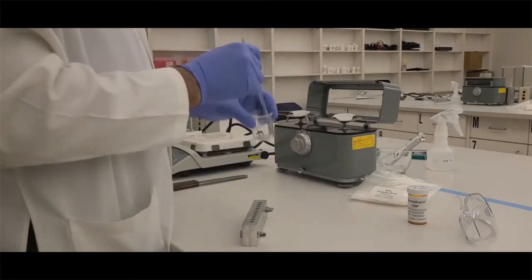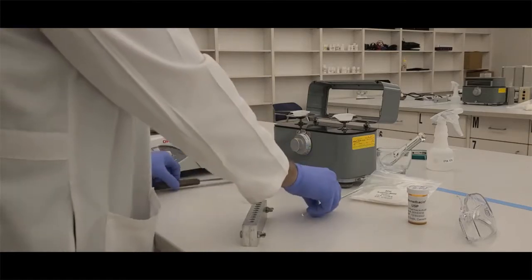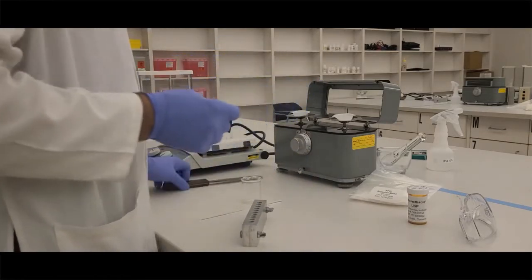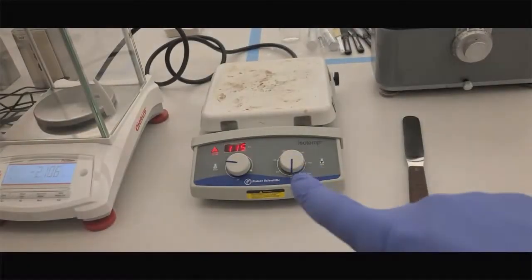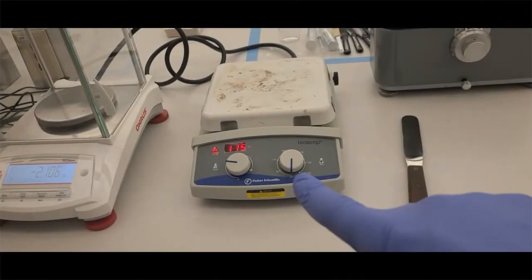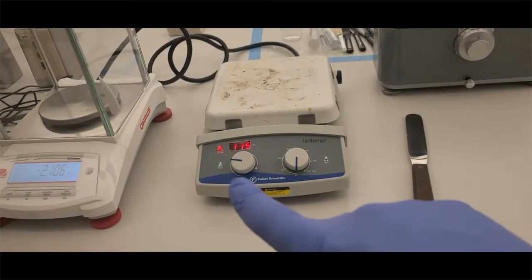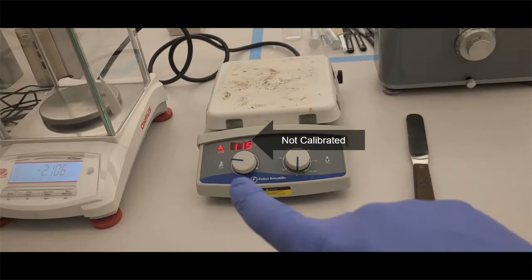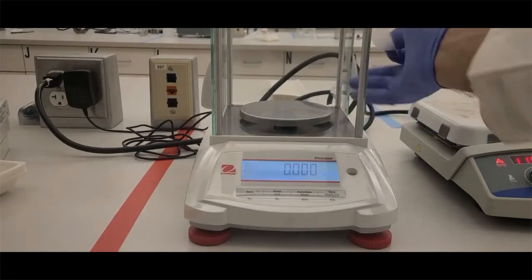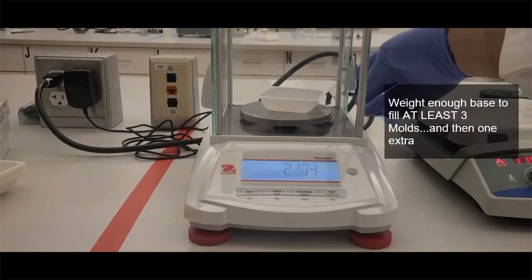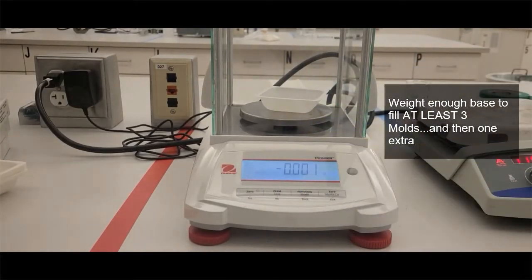You also need a glass beaker and a stir rod. The smaller the beaker, the less waste you'll have. You also need a metal spatula—make sure it's metal. Our hot plate is another item we need. Some hot plates have two knobs: one for heat, one for the stirrer. We only need the heat. The calibration is not accurate, so don't use them. Your instructor will tell you the temperature to use.